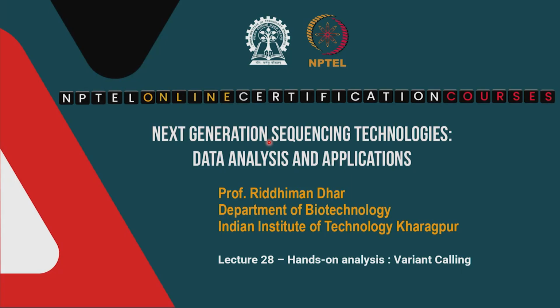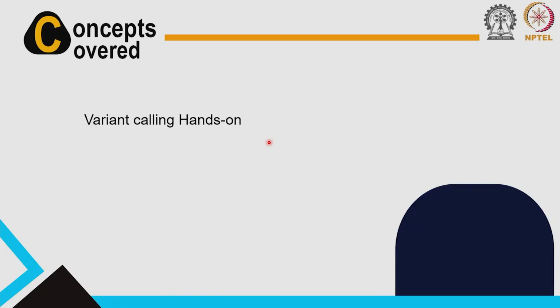In the last few classes, we have learned about how to do variant calling. We have discussed different variant types, and in the last class, we focused mostly on SNVs, SNPs and small indels. We have talked about the pipeline that we use, different filtering approaches, etc. In this class, the focus will be on doing the hands-on analysis. We will utilize a tool to actually do this analysis ourselves, and we will do some variant calls. This is the topic that we will be covering in this class.